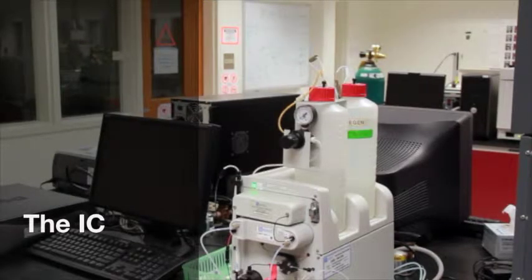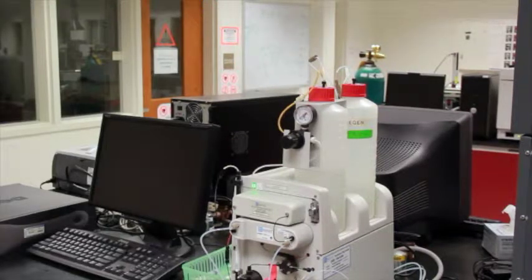Welcome back, everybody. Today we're going to be working with the IC. A couple things to keep in mind with the IC is you want to check your regenerant and eluent levels before you start running. The regenerant container should be completely full to the top with no headspace. The eluent container, as long as it's halfway full, you will have enough to run your samples for the lab.